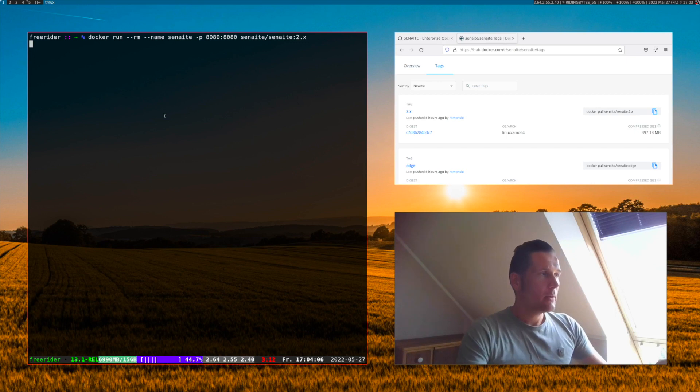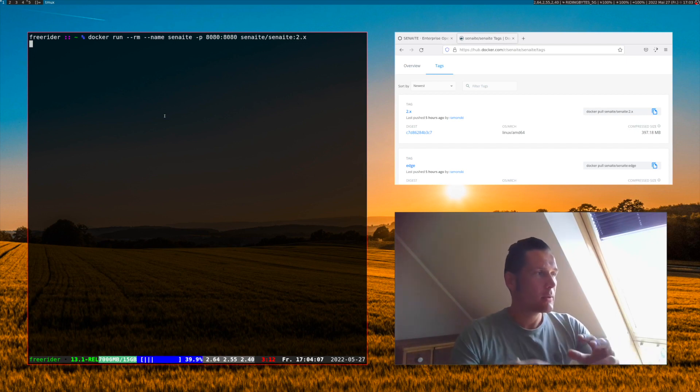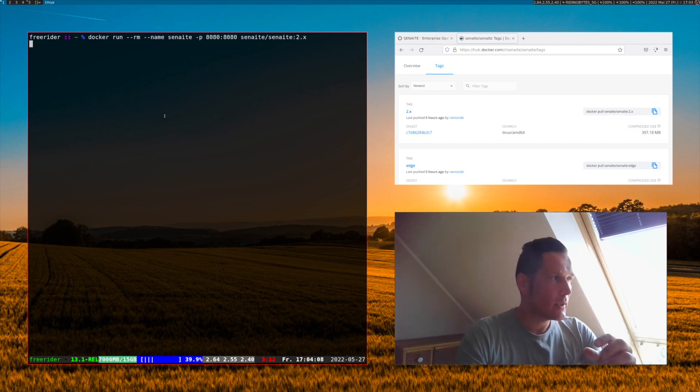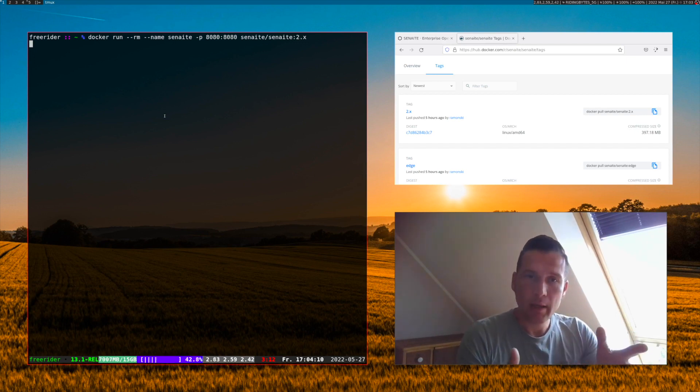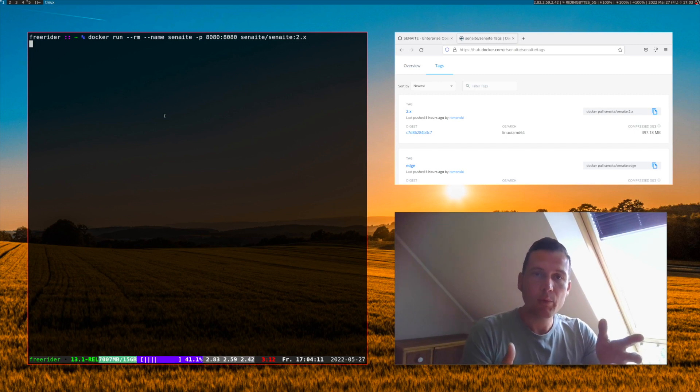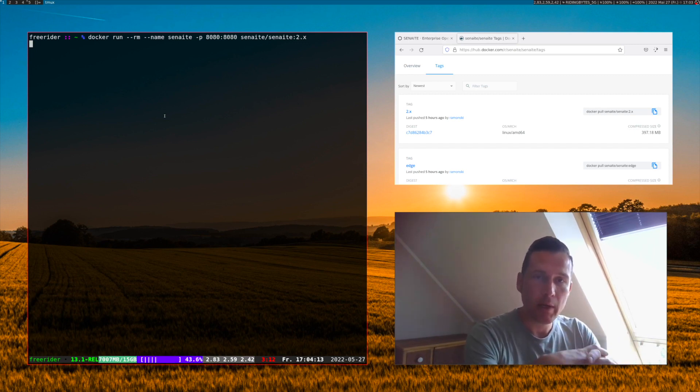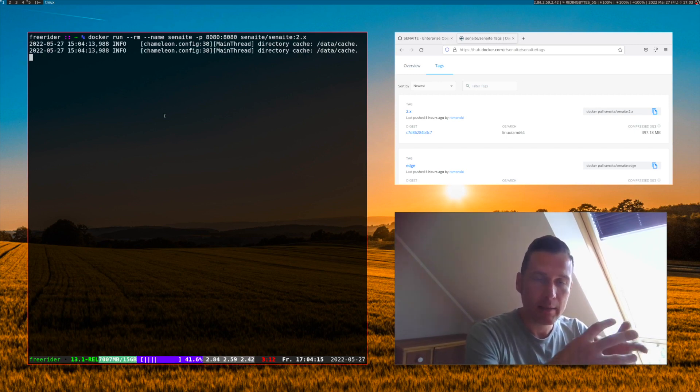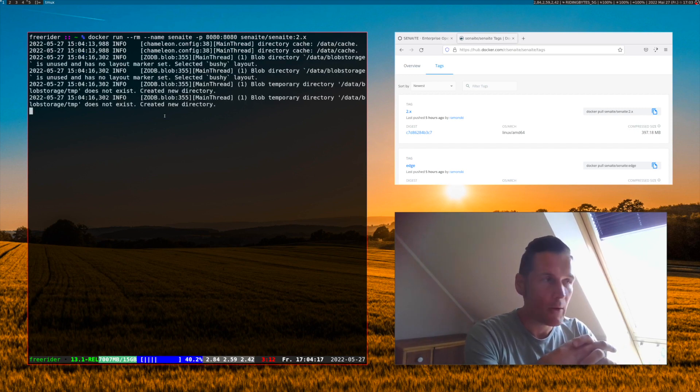Now what Docker does is it uses the image and creates a running container instance for us where we can access the container on port 8080.